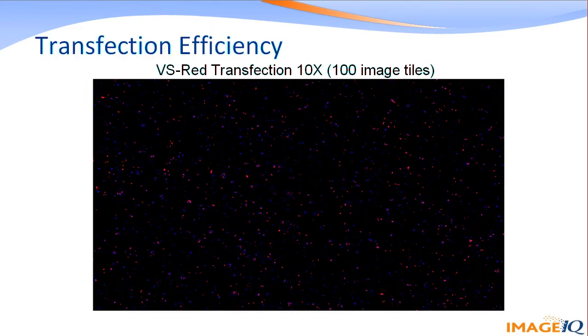Traditionally, to assess whether your population of cells on a cell culture surface area is positive for a particular protein or stain, a technologist will review a slide on a microscope, randomly taking images across the culture surface area or looking through the oculars and then counting with a cell counter. This can create a number of errors. It can be imprecise, it has issues with accuracy, and it can underrepresent your sample depending on the number of images or fields that you analyze.